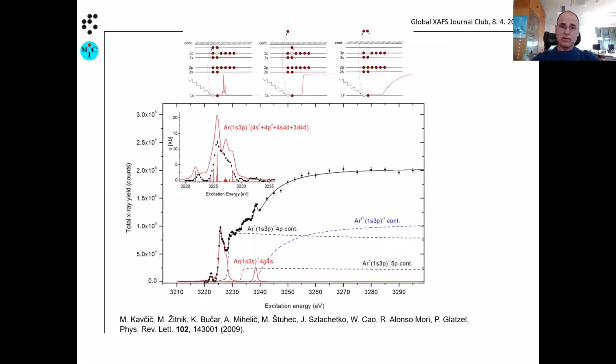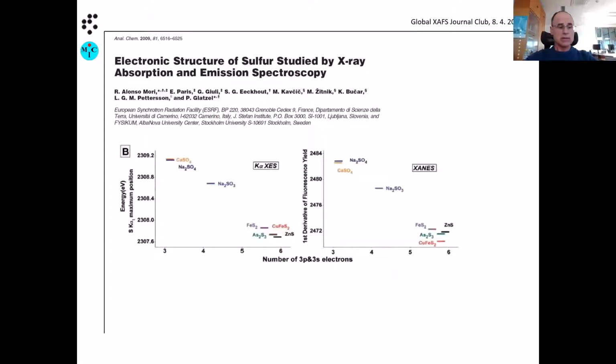And it turned out, so also here I will show the next step. Already during our first run at the synchrotron, we were immediately directed into the direction of solid materials and sulfur. In the same campaign, we also did measurements on different mineral standards, and the results of those measurements are in this paper, which you can see.